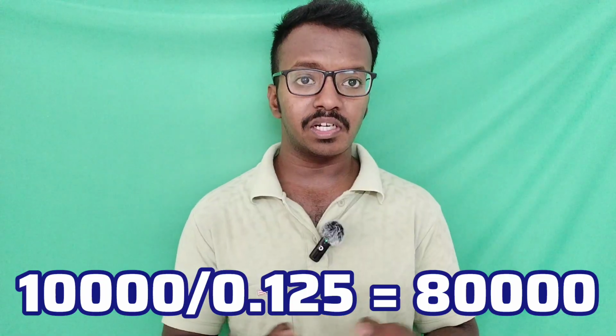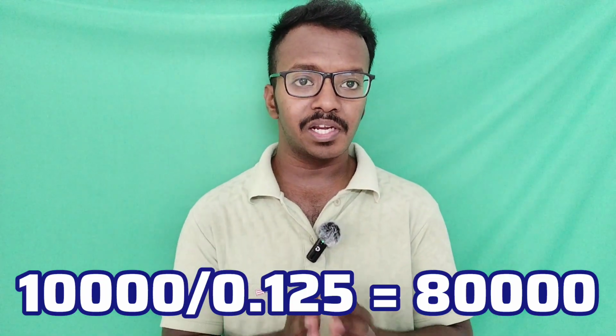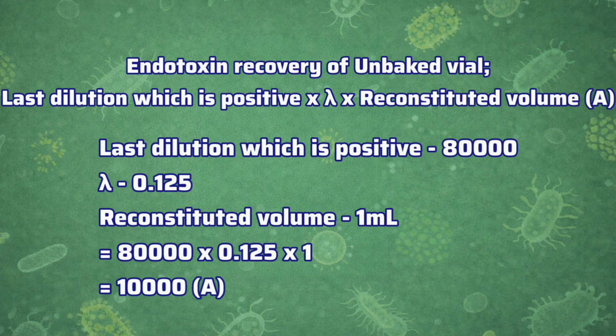We are challenging 10,000 EU, so 10,000 divided by 0.125 is equal to 80,000. Last dilution which is positive is 80,000, times lambda 0.125, times reconstituted volume 1 ml.